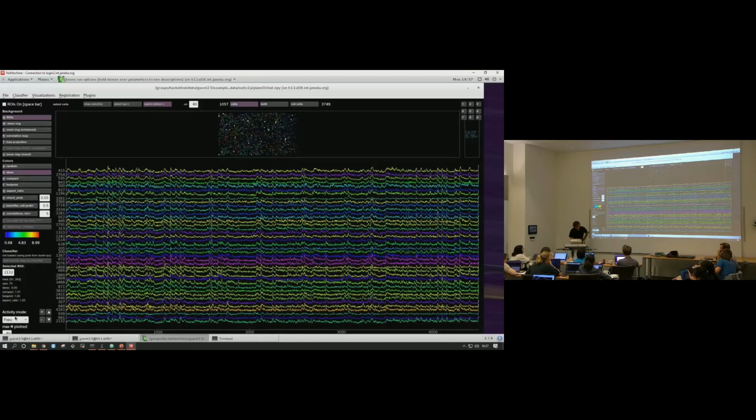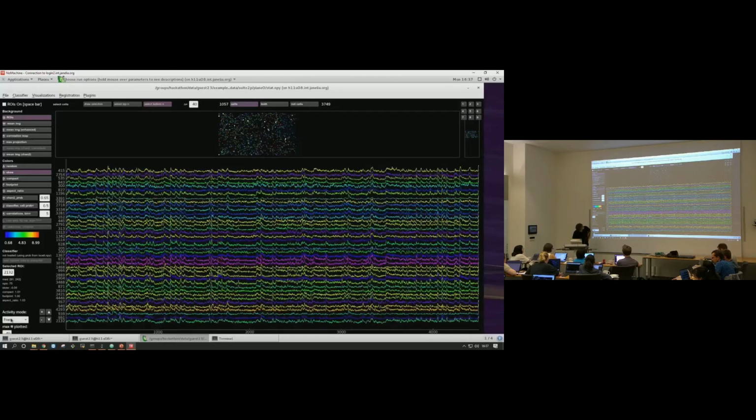So just switching back and forth between those two, it doesn't look like... That's a neuropil chart, so you F versus F corrected are a little bit different. I mean, do any of these traces look like the neuropil? I don't know, maybe. You can probably look more closely. You can just select a few of the cells one by one and go through them.